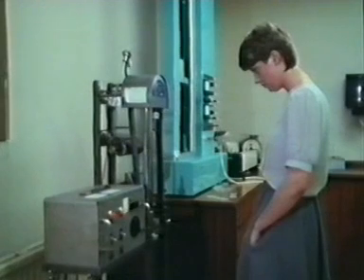Tests of this kind are very important to people making things out of the plastic. It's still stretching. Remember, this has to do with the way in which the carbon chains are arranged in the sheet. In a direction at right angles to that in the first test, a specimen from the same polyethylene sheet behaves quite differently.